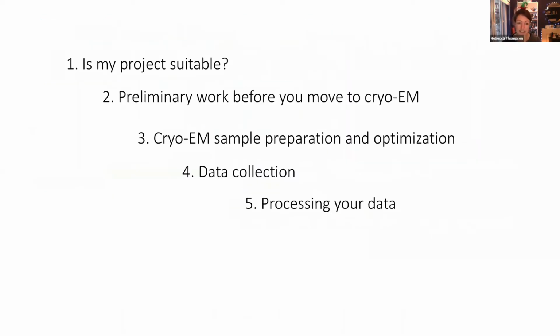So this is essentially what I'm going to be talking you through today. So first of all, is my project suitable? What we would typically expect before you would move to cryo-electron microscopy, a bit about sample preparation and optimization through to data collection and data processing. So kicking off, is my project suitable?